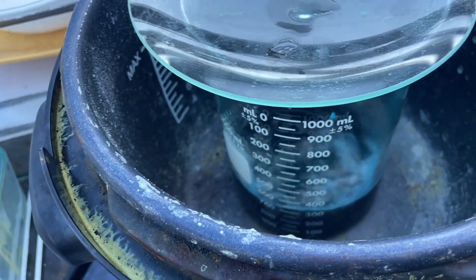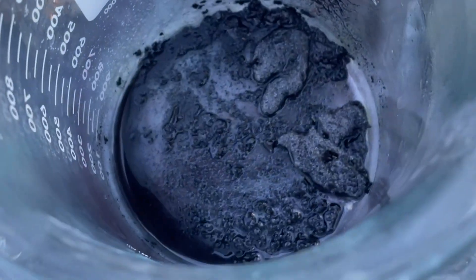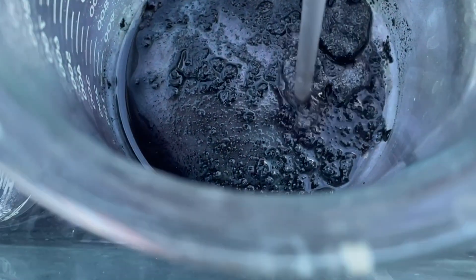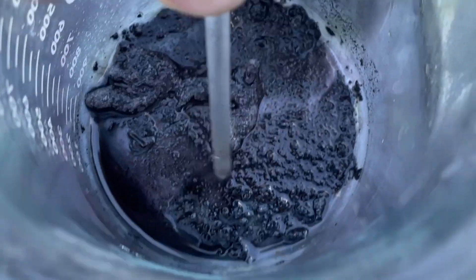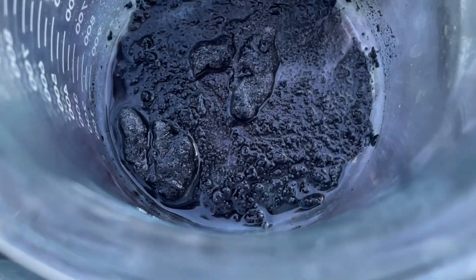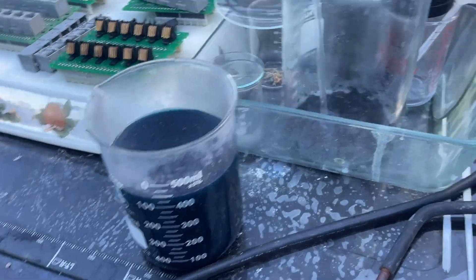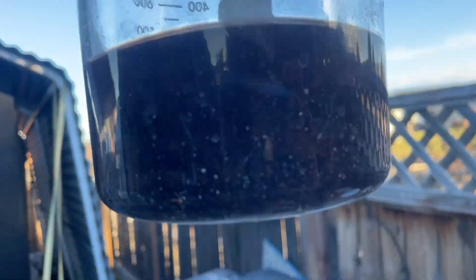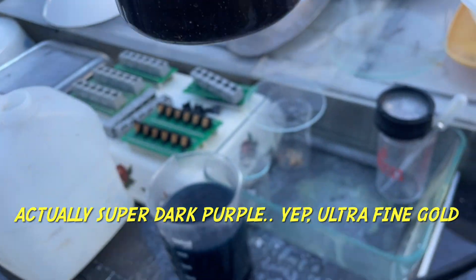I'll pour off that solution and see what we got in the bottom. I got that decanted — you can see there are still some big chunks in there that are fairly hard and don't break up totally. Most of the little stuff is totally eaten up. I'm going to hit it one more time with dilute nitric now that we've got off about 90%. Looks like I added 300 milliliters of water — it's still pitch black.